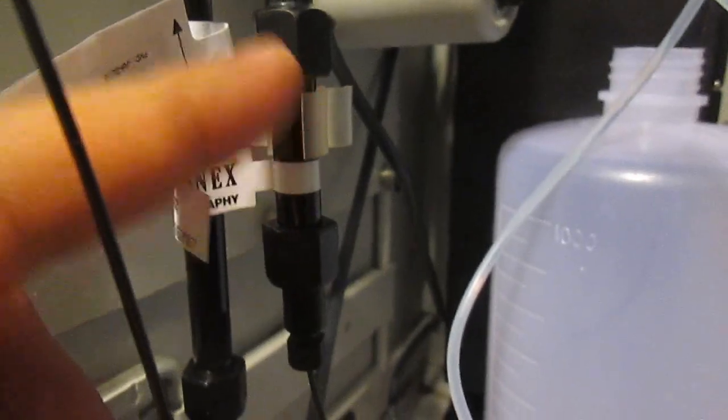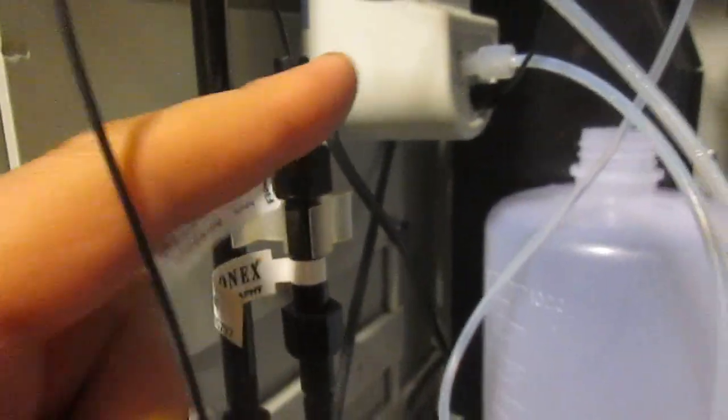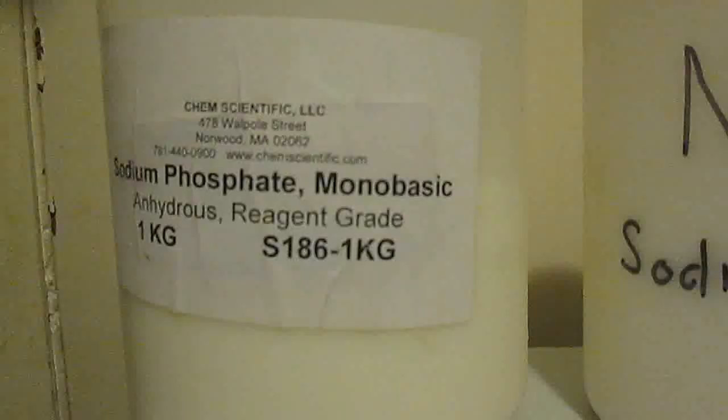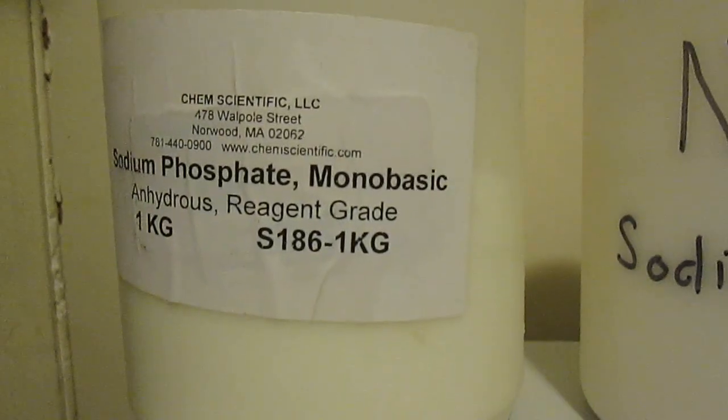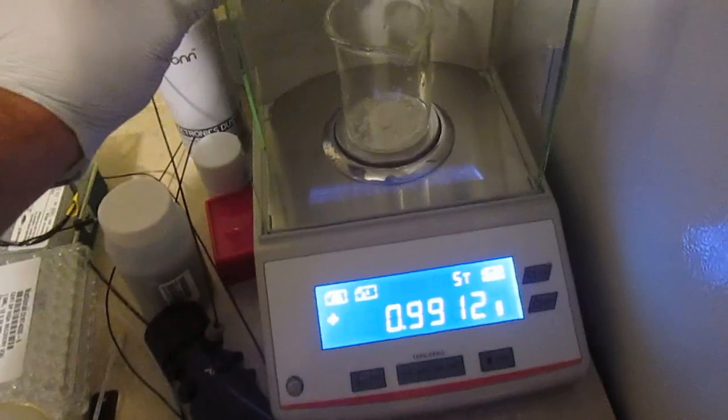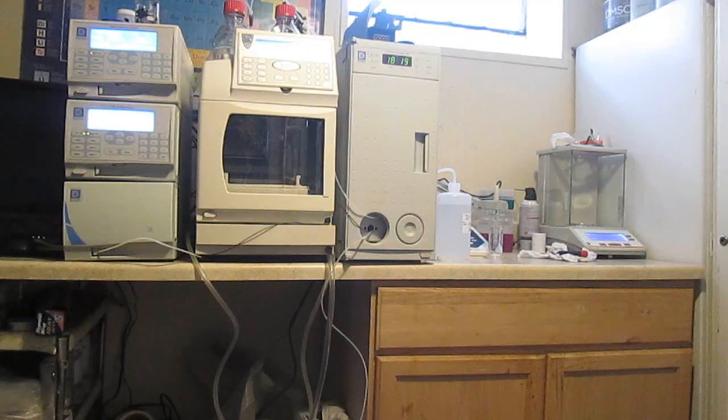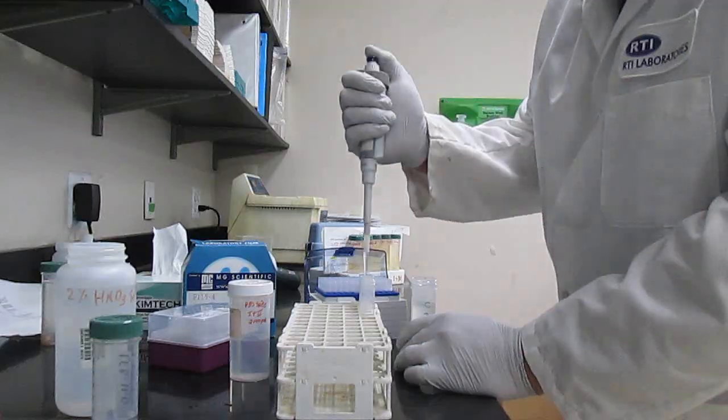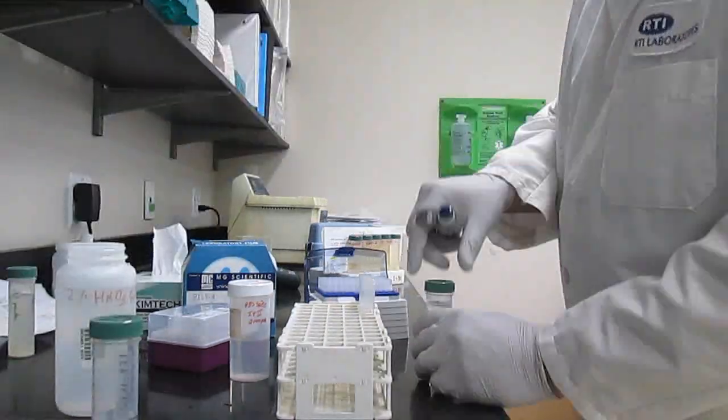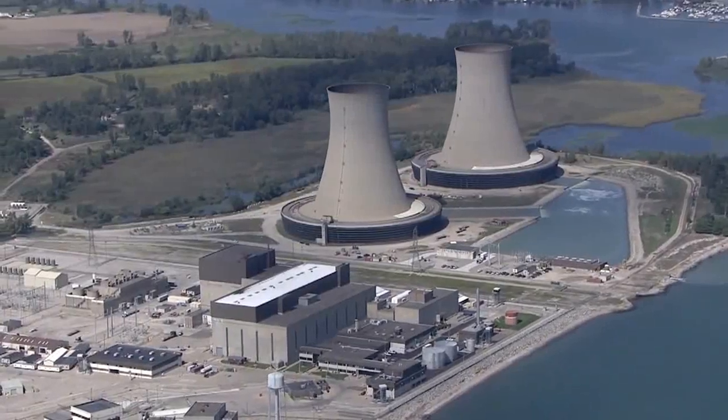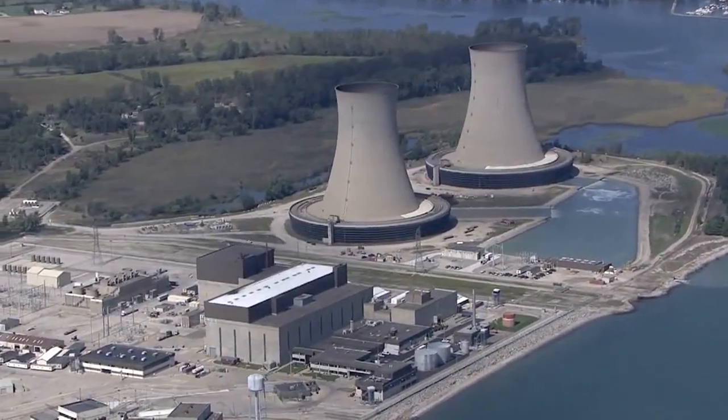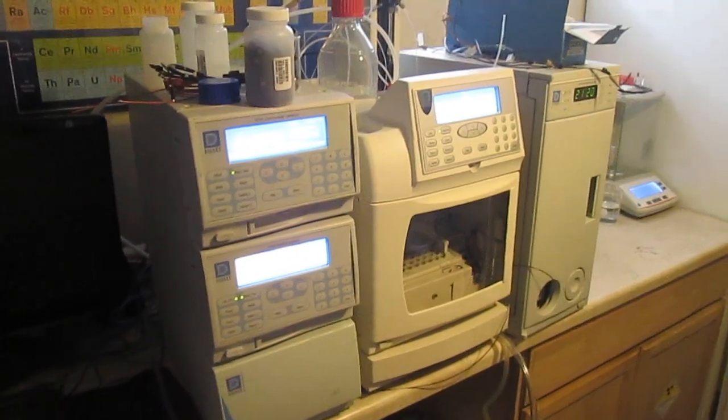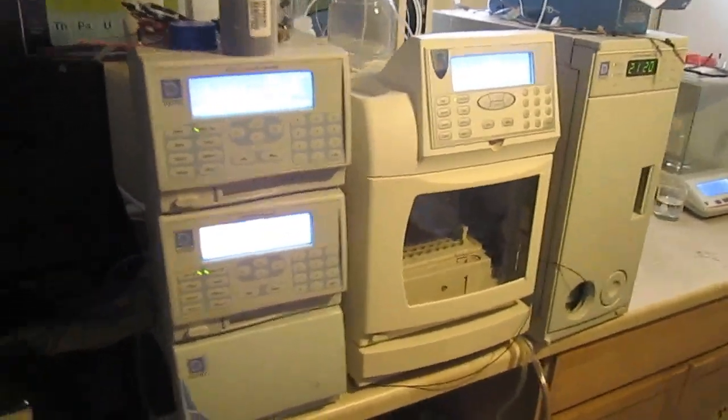I did not mention a guard column or the suppressor for the sake of simplicity. So this is a qualitative and quantitative analysis. Ion chromatography is widely used in applications ranging from environmental labs, nuclear power plants, and medical labs. And now I have one at home.